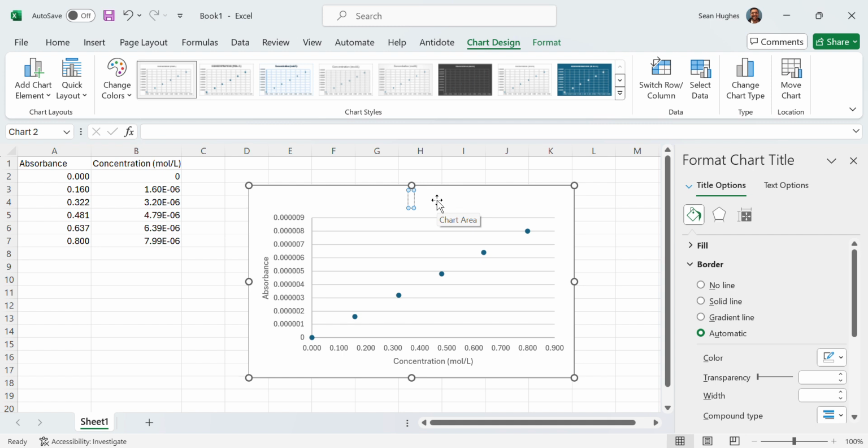So in this case, one good title might be to say what this actually is, and what you've generated here is a standard curve. So I'm going to use that as the basis of my title. And what is it a standard curve of? Well, specifically I characterize blue dye. So I'm going to add that in there. And then I'm going to add a little flair, a little specificity. So a parameter that seemed to be important when we were doing our data acquisition was the wavelength at which we did this. So if you did this at a different wavelength, your results might be different. So I'm going to add my wavelength in. I'm going to report that mine was at 630.6 nanometers. Yours might be different. It doesn't matter. And then usually if this is the first figure in your report, you could even call it figure 1. All right.